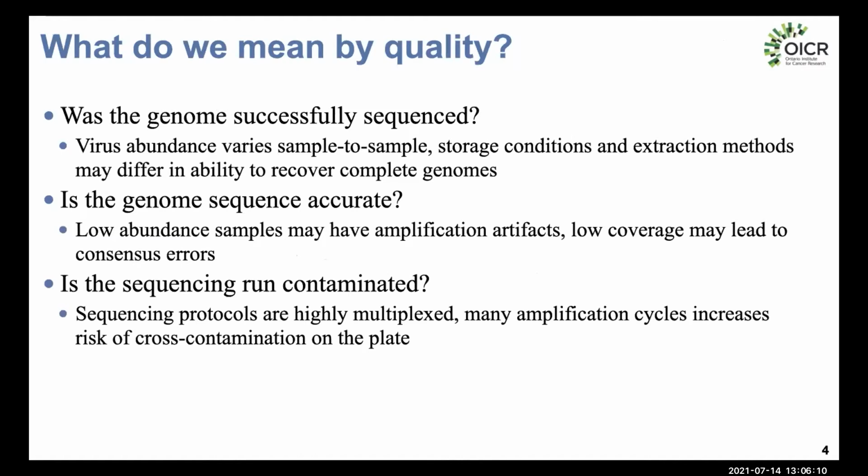So now I'm going to get into talking a little bit about genome quality. So we can think about quality in different terms. At the most basic level, we might think about checking just whether the genome was successfully sequenced. So almost always, at least in Cancogen, we're starting from clinical specimens, which may vary in the amount of virus that's actually present in the sample.